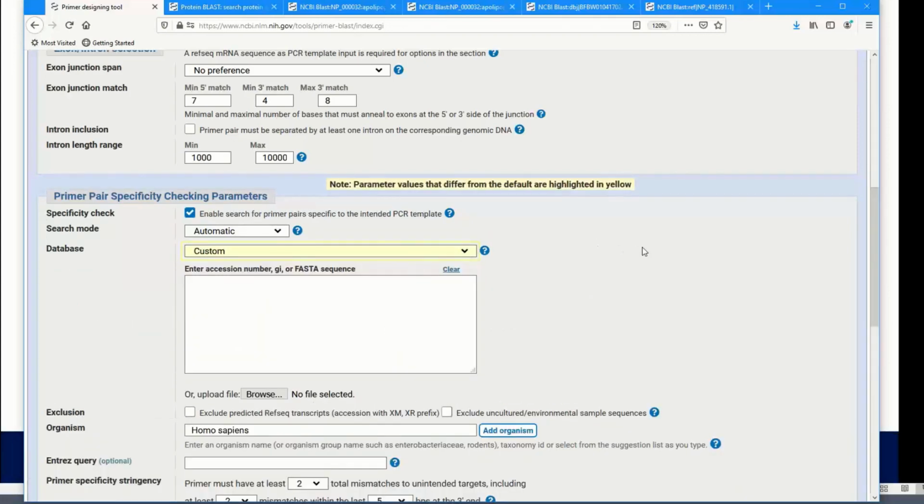So you could potentially put some accession numbers down here to use more than one assembly. It will not take assembly accessions, unfortunately. So if you had chromosomes from a particular assembly, you could put those in here. Just a warning that it could quickly get too large for this to work, because the BLAST portion of a Primer-BLAST search is a wide open search, and so it's very expensive to run. It consumes a lot of resources, and so it may just get out of hand real quickly if you do that. But it's possible to enter accession numbers down here.